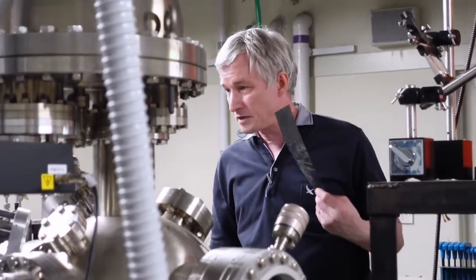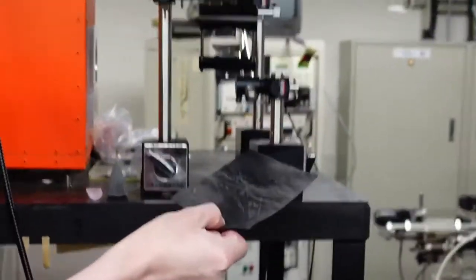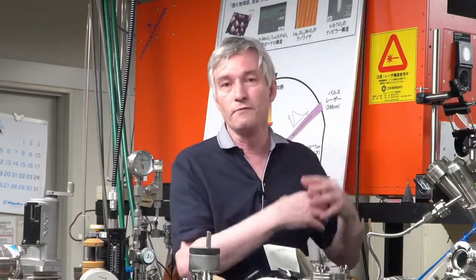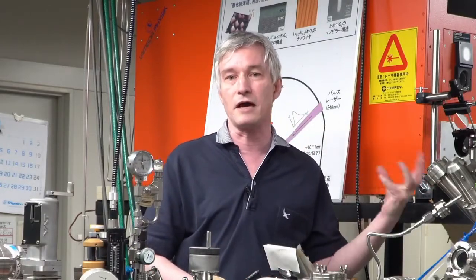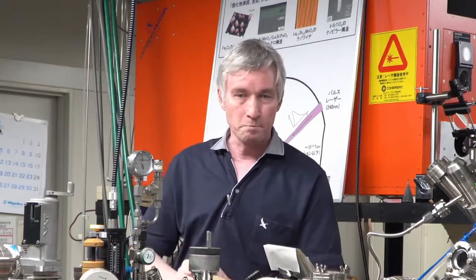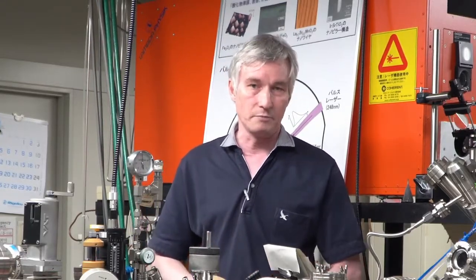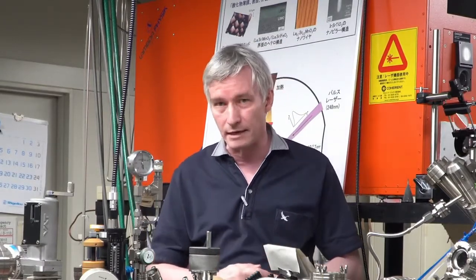When I put the black piece of paper into the focus point of this laser, you can see plasma coming from the paper. These flashes of light are very high temperature gases formed in the evaporation process, and the sound is just like the sound of lightning strike. We do this evaporation, of course, inside the vacuum chamber, and that way we can evaporate and grow these very thin oxide materials on a scale of single atomic layers or single unit cell layers.